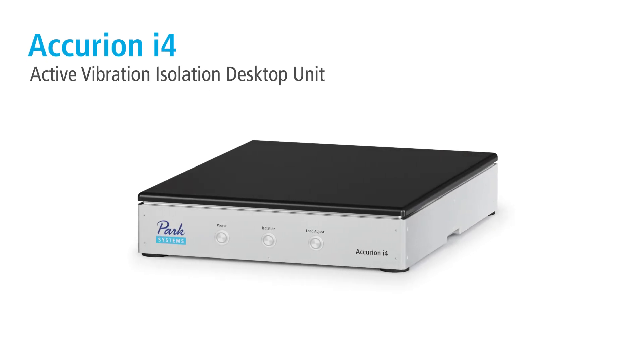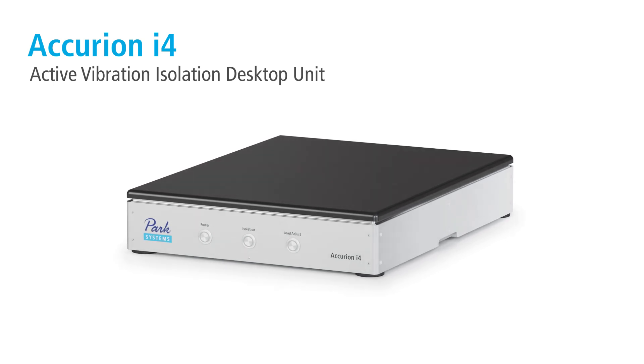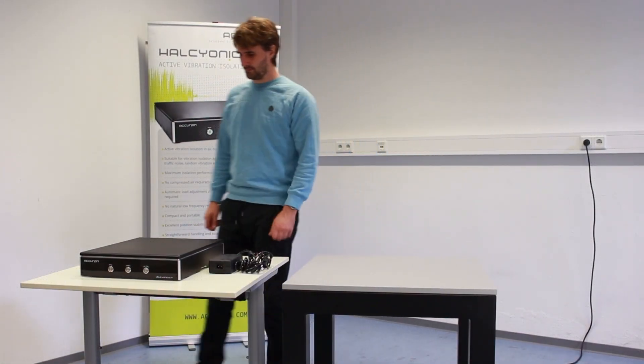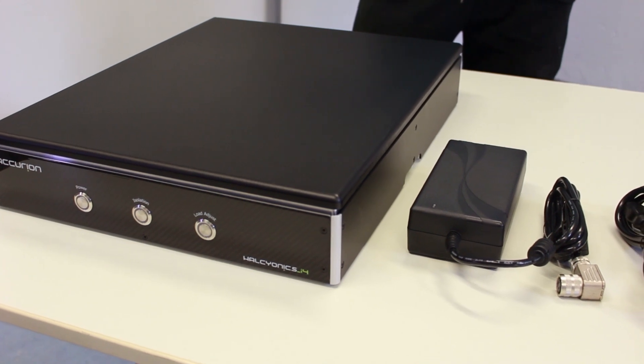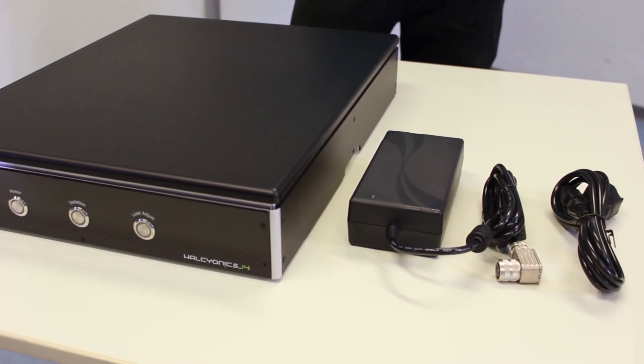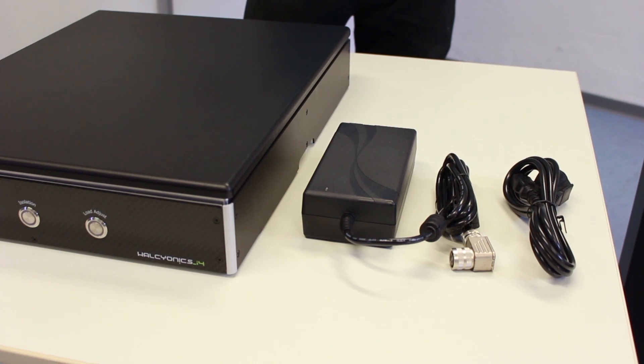In this video we are going to demonstrate how to start up the i4 active vibration isolation system. The delivery contains the isolator, the power cord and the power supply. In case you stored the system in a colder environment, please allow it 2-3 hours to adjust to room temperature before starting operation.